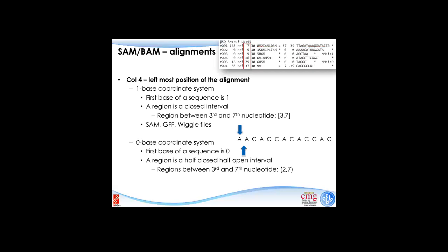In the past, we generated some data and needed to write code to load the data into the UCSC genome browser or IGV, which I will talk about later today. And then we saw every single nucleotide shifted by 1 base, because we didn't pay too much attention to this.